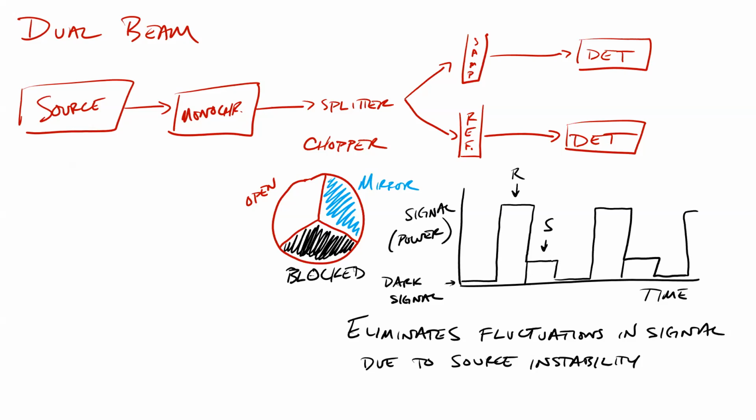But what they do is diodes sort of control the flow of electricity. They allow electricity to flow in only one direction. And so a light emitting diode takes electricity and forces it through this material that emits light when the current flows through it.